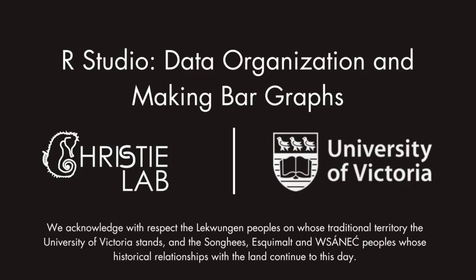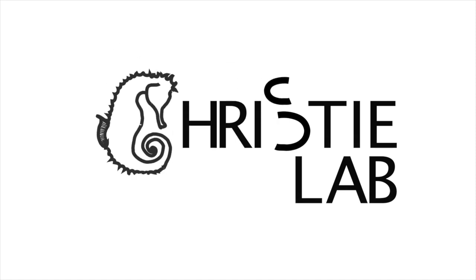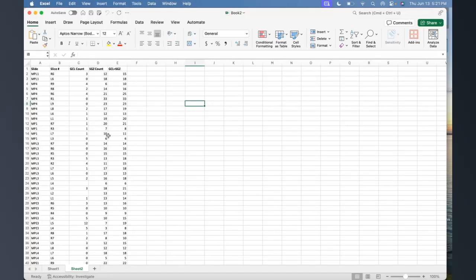In this video, we will go over how to transform your cell count data in order to make a bar graph in RStudio. Starting in Excel, we have our cell counting spreadsheet.